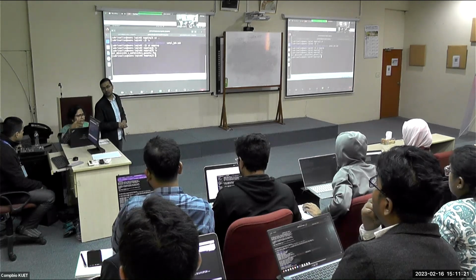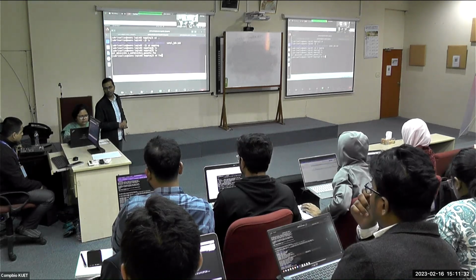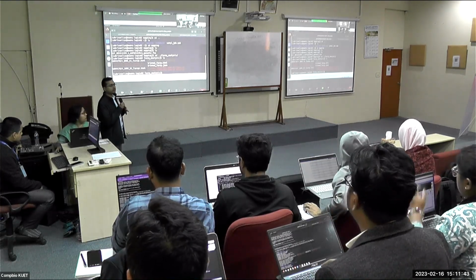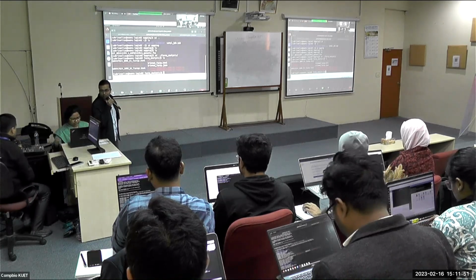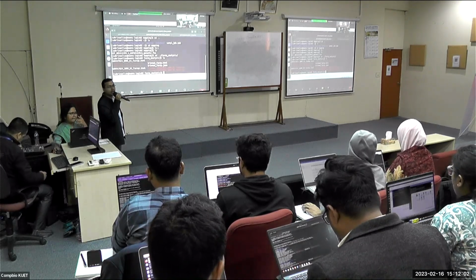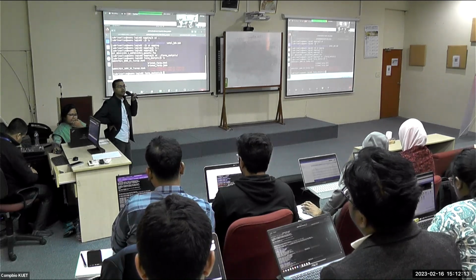And in the FastQ analysis folder, you already have the trimmed reads. Just check whether it is there. So go to the FastQ analysis folder, which is outside the mapping. And just check whether the trimmed files are already there, because you copied this folder earlier. So all of you have copied it in the OSC FastQ analysis folder, right? How many of you didn't? How many of you have not uploaded this trimmed file in the FastQ analysis folder of OSC? No one. Great.